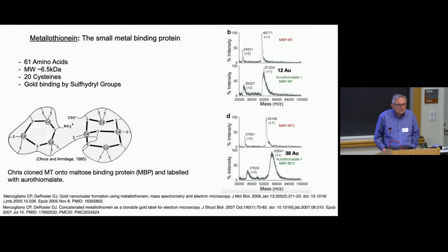Cells really don't like gold salts. They really don't. And so people who have used this decided that wasn't really a particularly good direction, although I must say Christina Risco has shown that you can get labeling within maybe less than half an hour, and the cells don't show these cytotoxic effects for a couple of hours, so it may not be all over, but in any case, we had left it there.